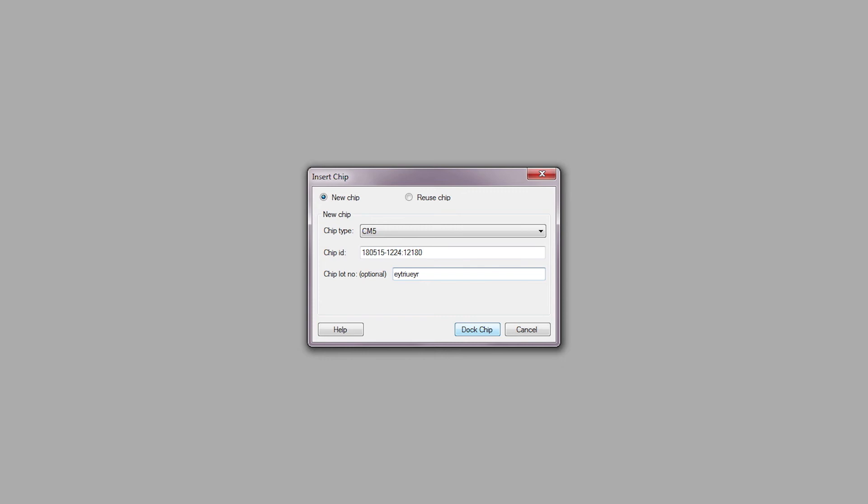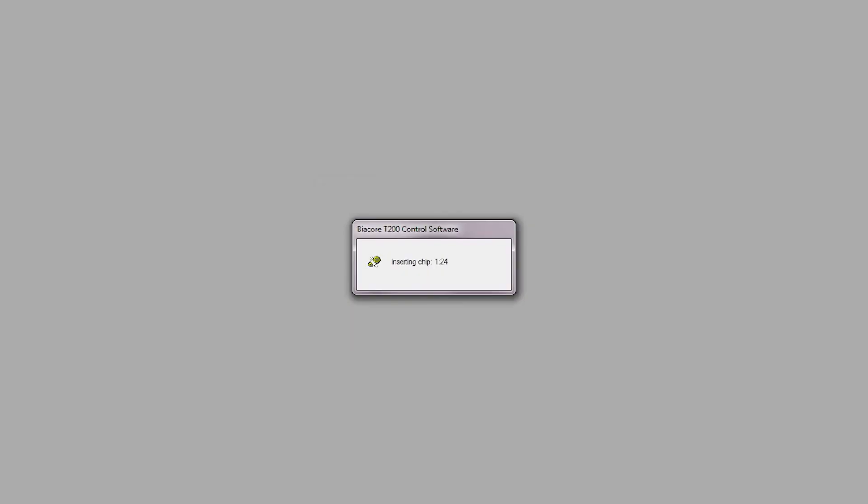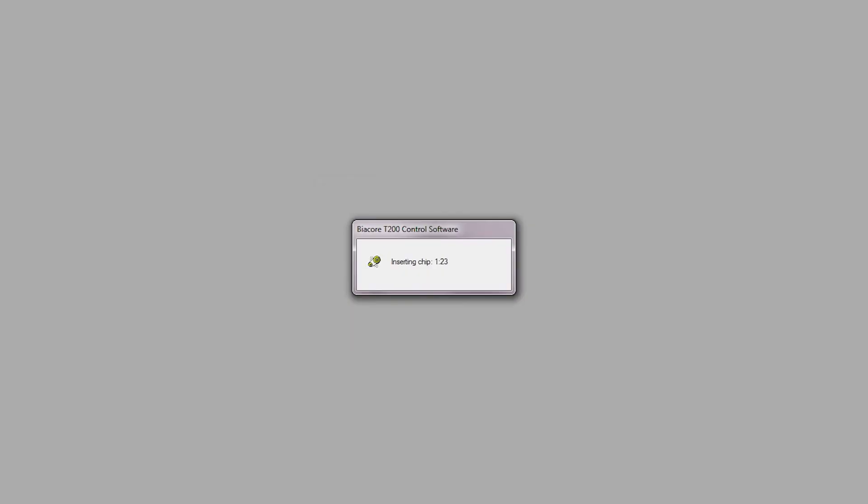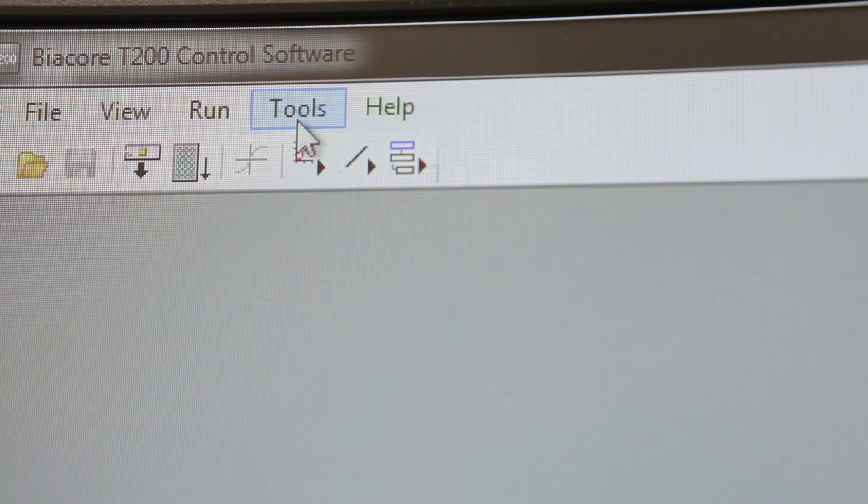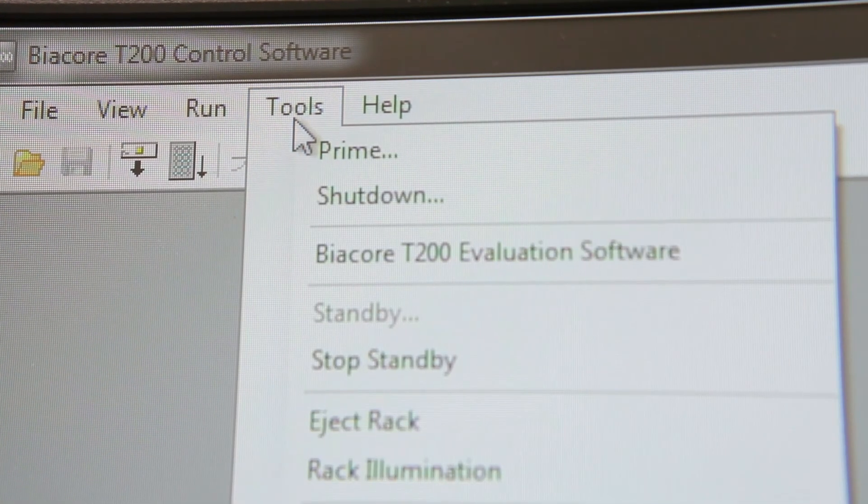Once the chip has finished docking, choose Tools and prime the system.